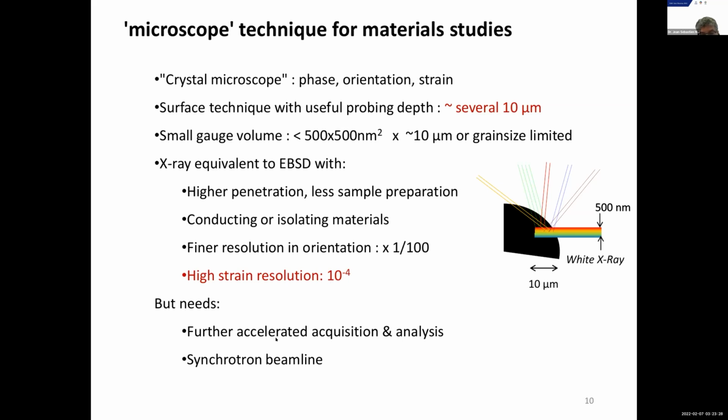So for sure, you still need a synchrotron beamline, and this is an old slide. At that time, I said that further accelerated acquisition and mostly analysis should be provided. And now Ravi will present the first results we have to really accelerate the analysis of the data.